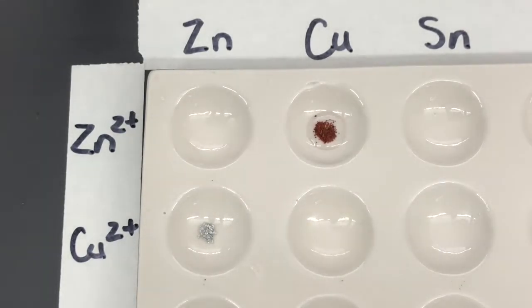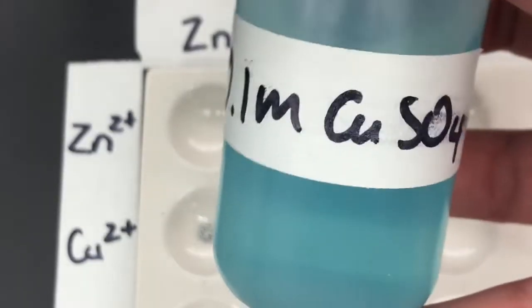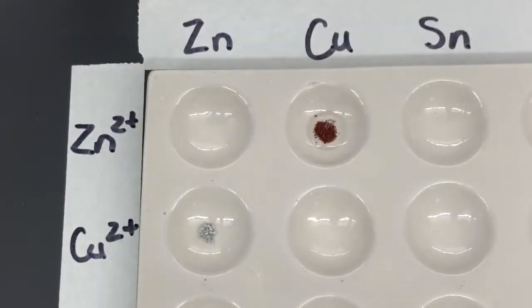Next, I'm going to grab some 0.1 molar copper 2 sulfate, and I'm going to add the copper 2 sulfate to the zinc metal.